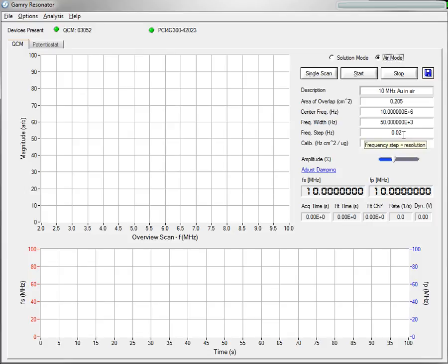When running in Air, it's important to decrease this frequency step, typically to around 0.02. You may be able to run slightly higher, but I would personally recommend 0.02.